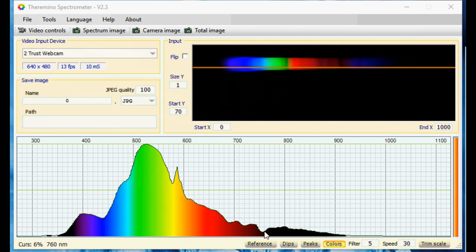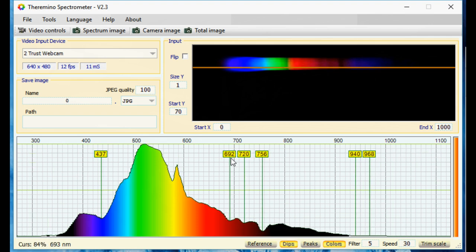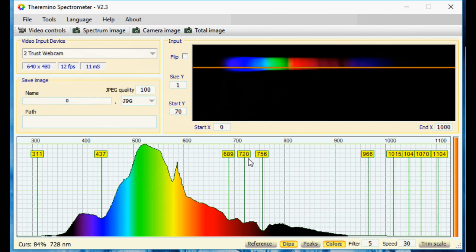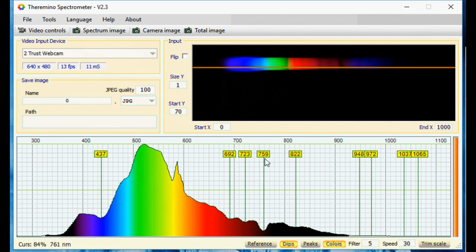This is an atmospheric absorption line showing around 750 nanometers, and it's due to water in the atmosphere. I think this one's oxygen. Here's another absorption. If we put the dips on, we can see the dips. So this dip is at 692 nanometers, 720 nanometers, and 756. It's the 756 which is the oxygen.